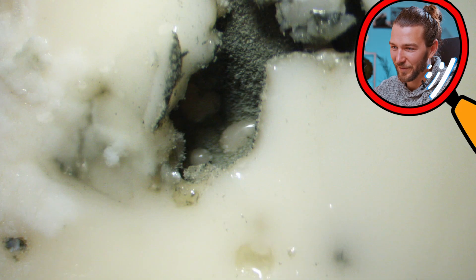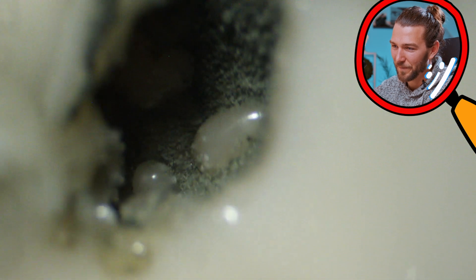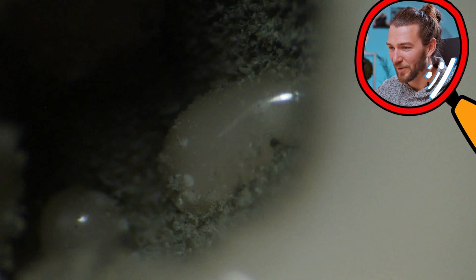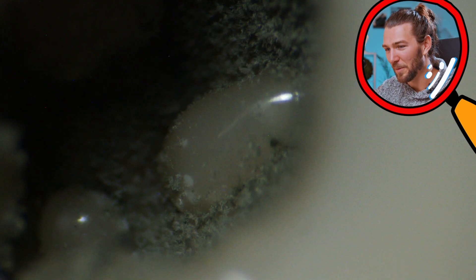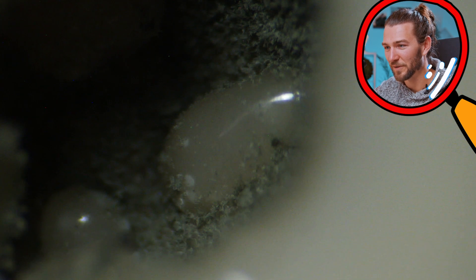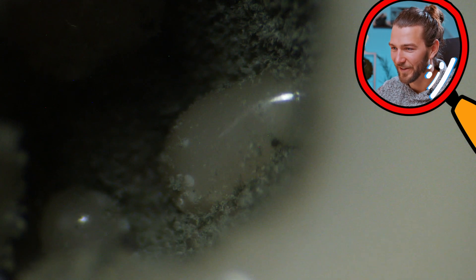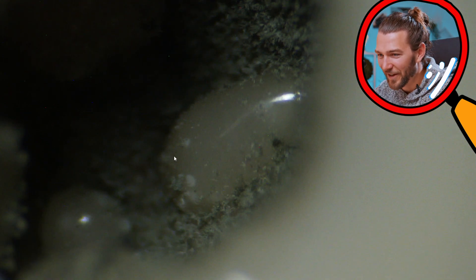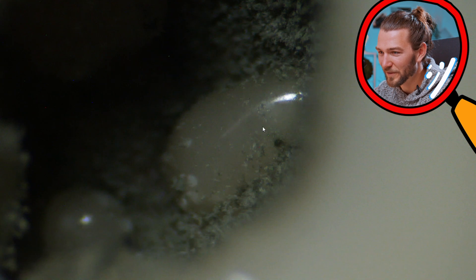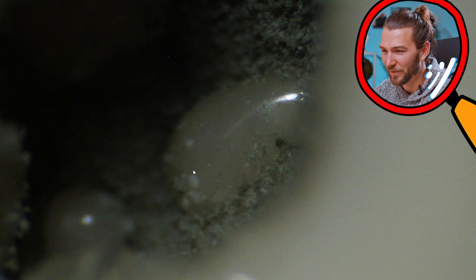Oh, it got warm now and this bubble was forming. Through the mold it came, it sweated out of the mold because the mold is very fluffy and soft. So this cheese is starting to drip out through the mold, and you can see how the mold particles, the crystals, are on top of this bubble.